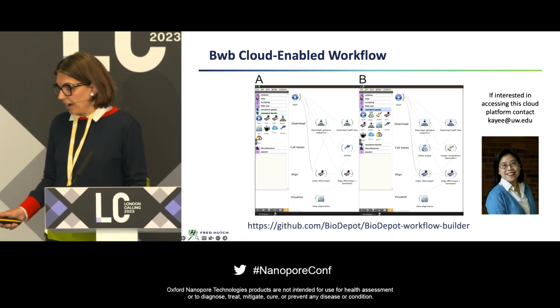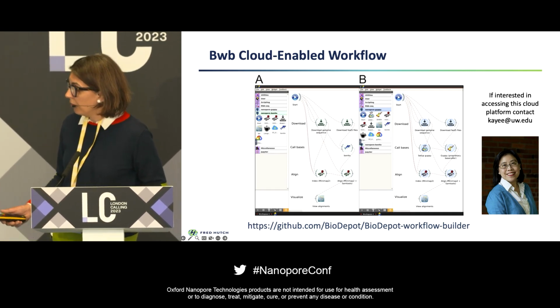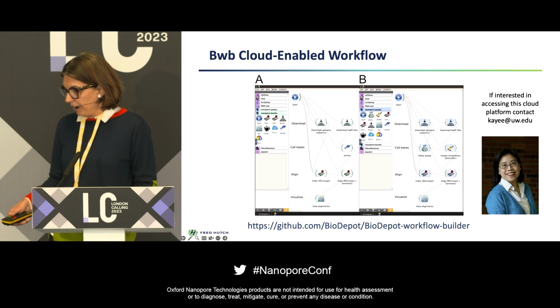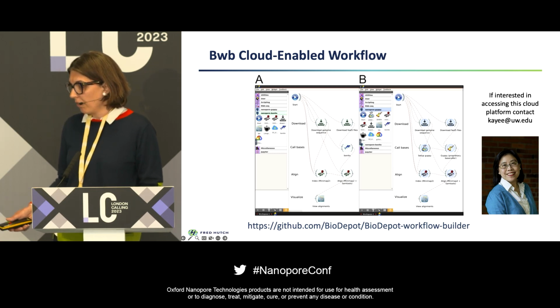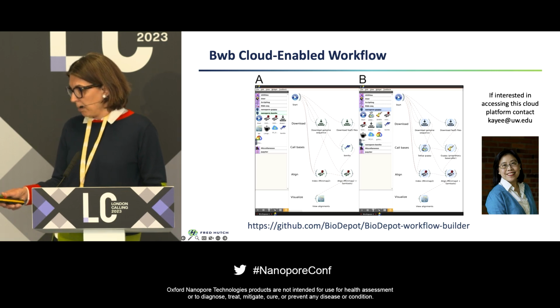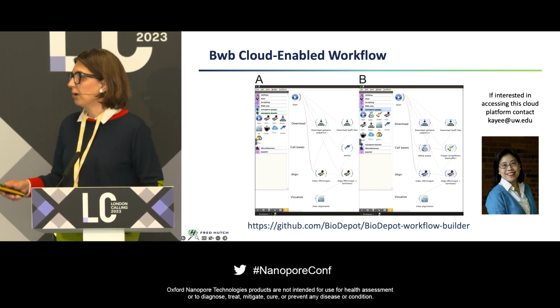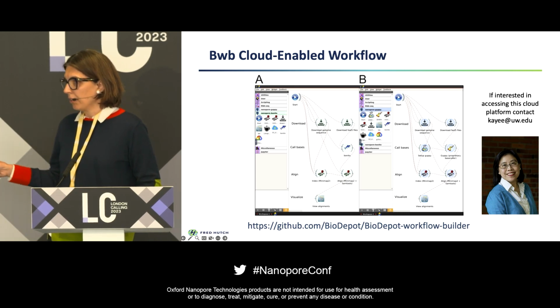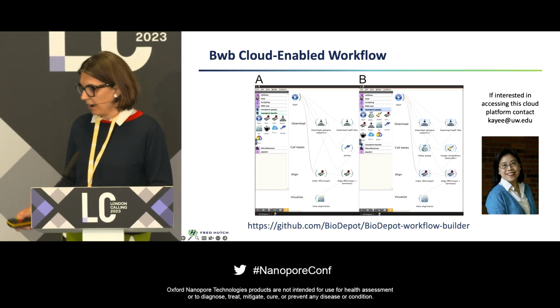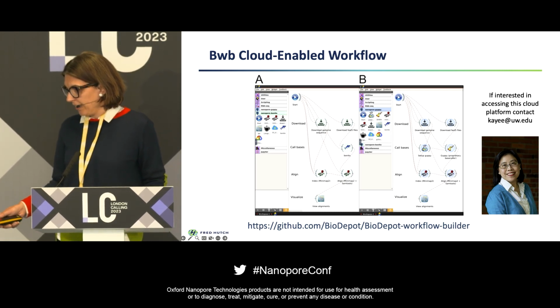This is a graphic example of how the platform works. These are two different workflows. On the left-hand side, you have different packages that are represented by the vignette, so you can drag and drop them on the panel, and you just create your workflow, and just hitting the play button you can see how it goes through all the different packages and get the results at the end. The GitHub address or the website is at the bottom.